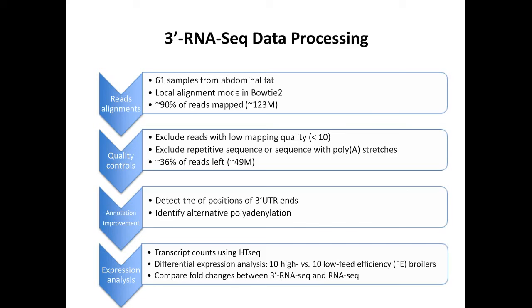Because, as I mentioned, we had both RNA-seq and 3' RNA-seq data, we used these two data sets to compare whether accuracy is comparable between RNA-seq and 3' RNA-seq. For this analysis, we had 10 high and 10 low feed efficiency chickens.